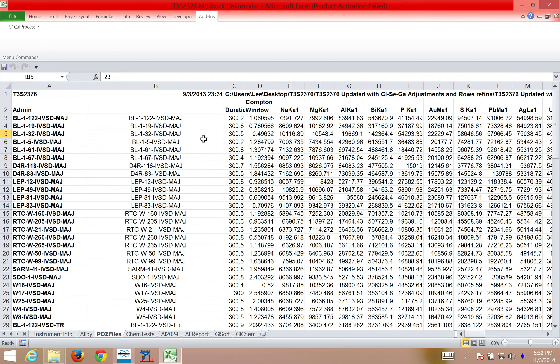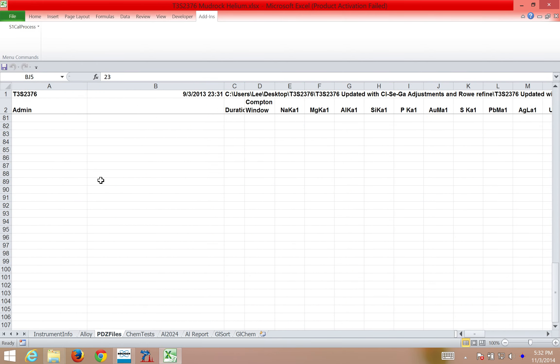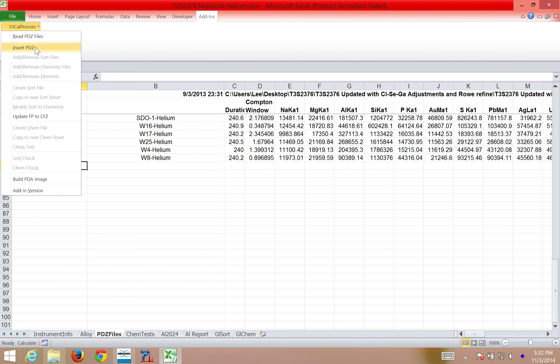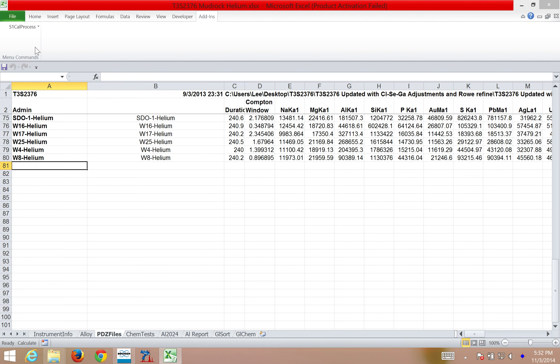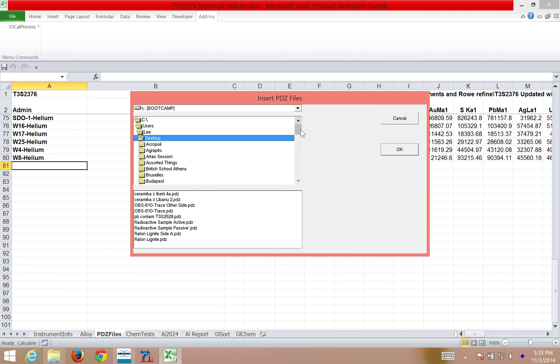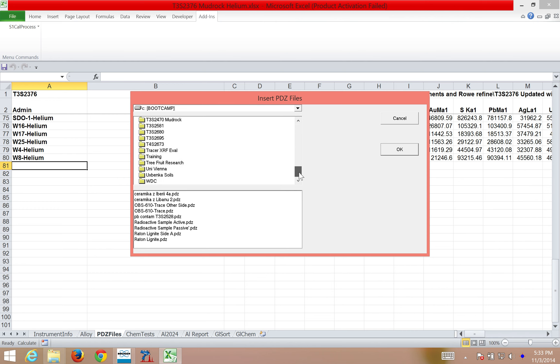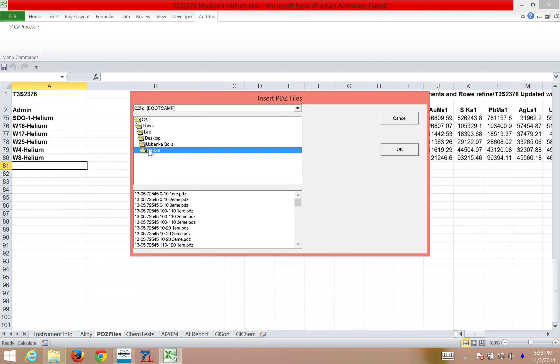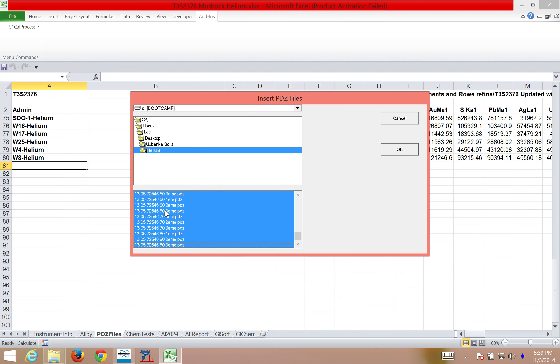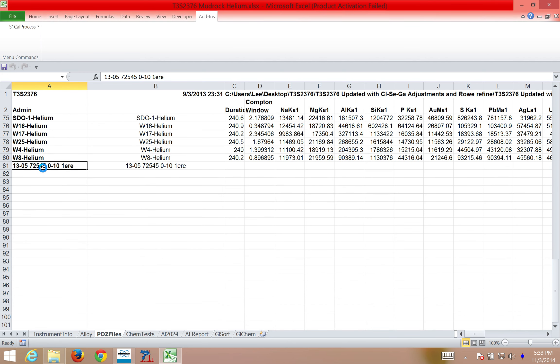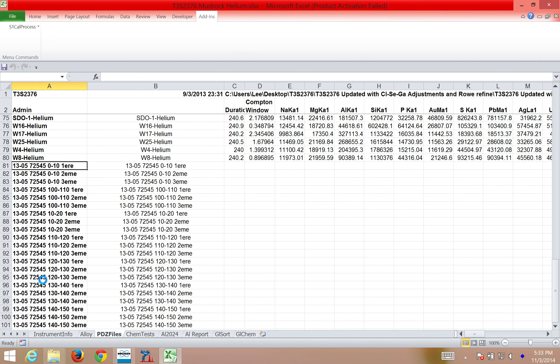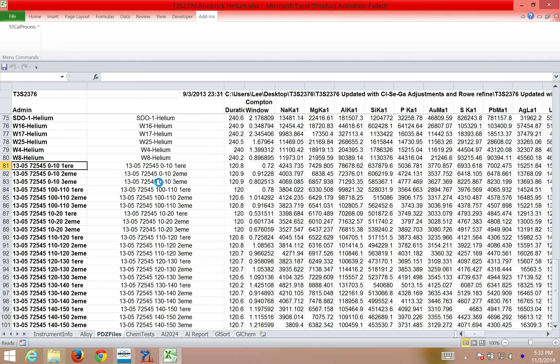In this case, I want to add spectrum that I want to quantify. So I come over here, I go to S1 Cal Process, and I select Insert PDZ. Once I've got Insert PDZ, I'm going to navigate to the folder that I want to quantify, in this case, from an archaeological site, I'm going to select spectrum taken with helium conditions, and I'm going to add them. So I click Shift, this way I can add all of them at once, and then I click OK. And now you can see these spectrum come in to be imported. These are the names, and then it's going to take a minute and then process the other information about these spectra.